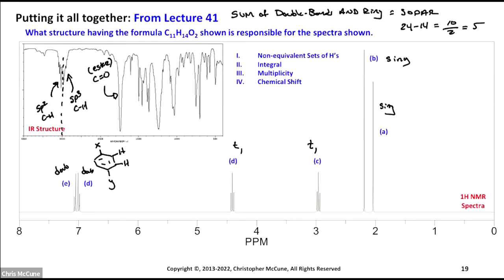And so we're just going to try to figure out what the rest of this stuff is. So I have an ester, perhaps then I have a CH3 on one side. I'm going to take a guess. And it's around 2 ppm, so maybe I have something that resembles, let's do this, a CH3 in the benzylic and a CH3 near the carbonyl place.